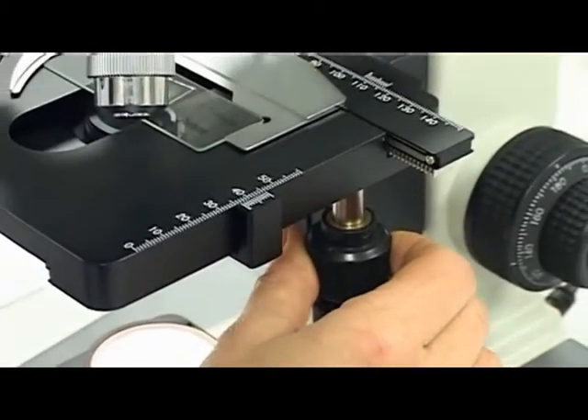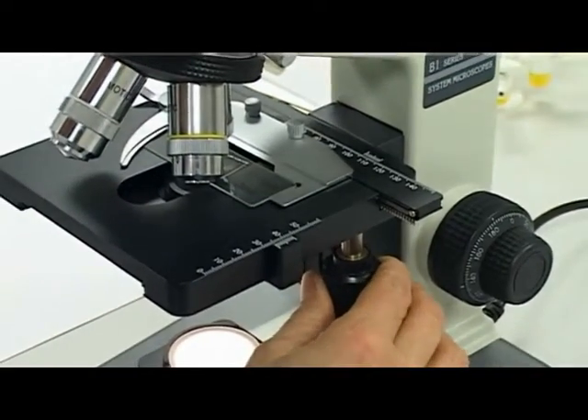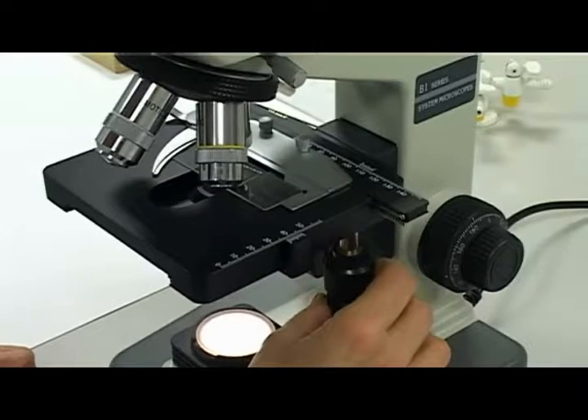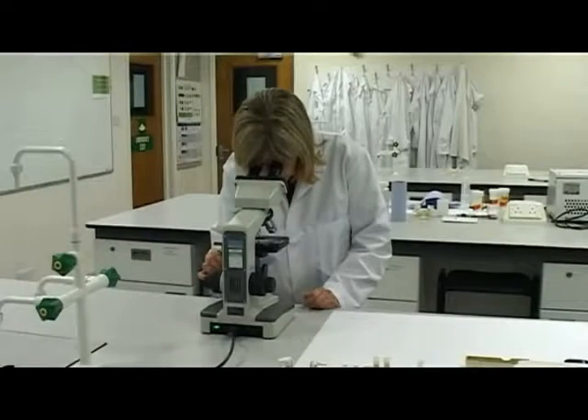Methodically scan the area of the slide to locate a crystal using the battlement technique. Place the crystal in the centre of the field of vision.